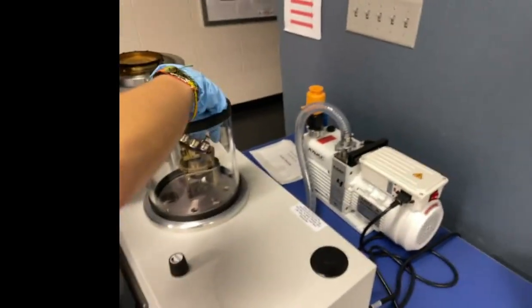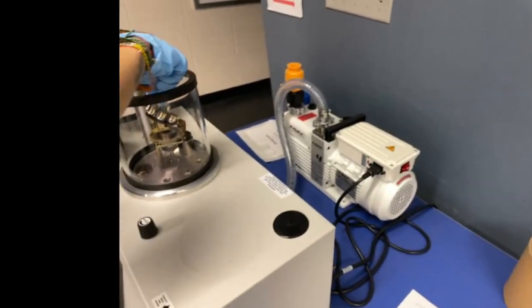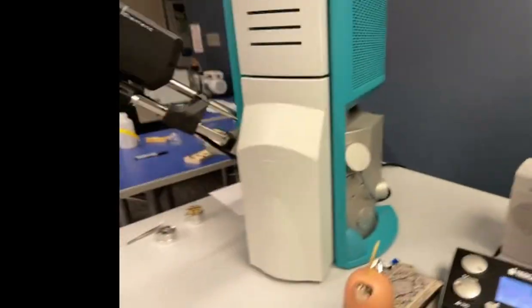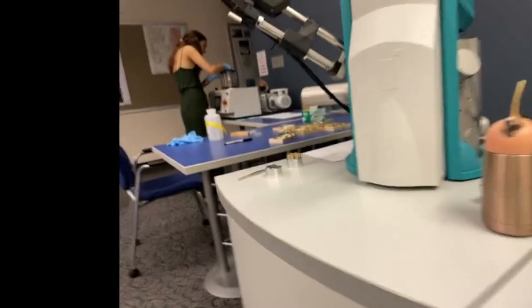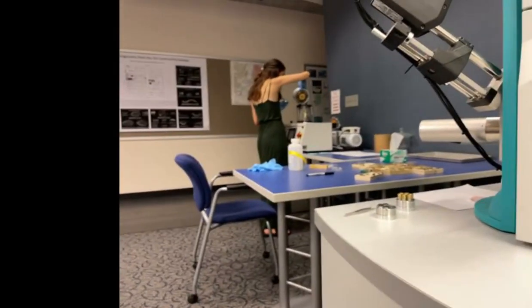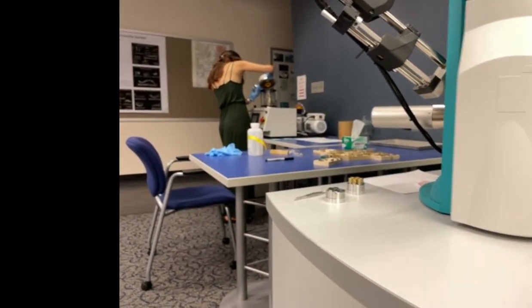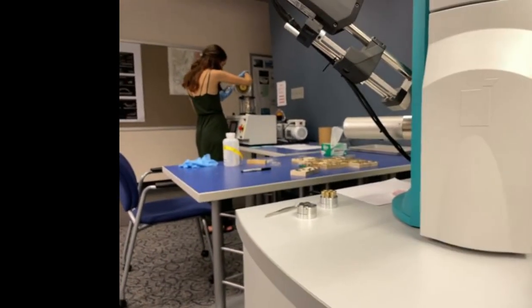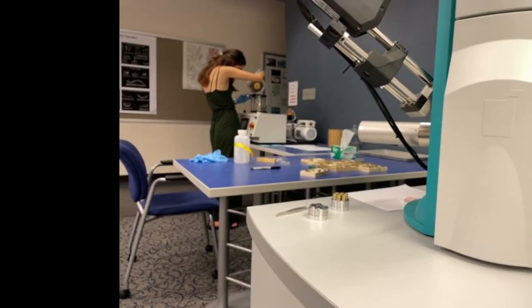We're just going to load them into the carousel for us. And back on the other side of the lab. Here you go. Awesome with the gold. Very nice. Good pun. And so all she's doing is putting them back into the carousel that she loaded them into originally so that we could carry them around.